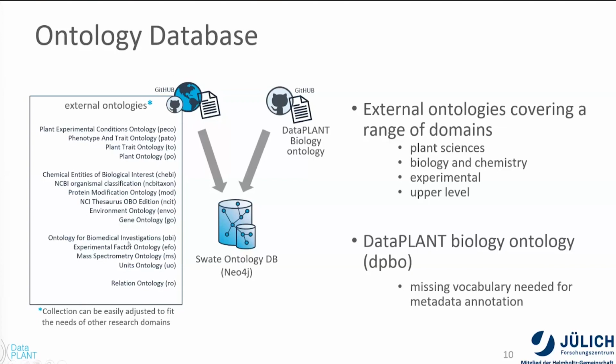And this is easily adaptable, so all different external ontologies can also be added. We have now also started to add bacteria-specific ontologies, because here we have use cases that also want to use the Swate tool for the metadata ontology.